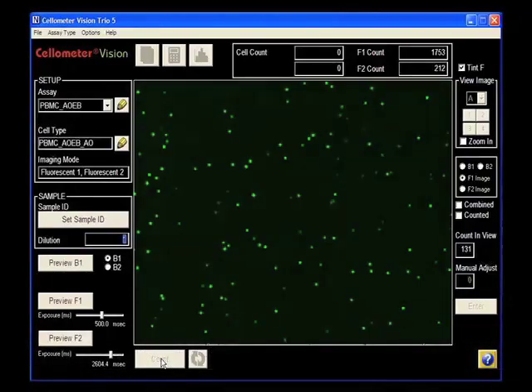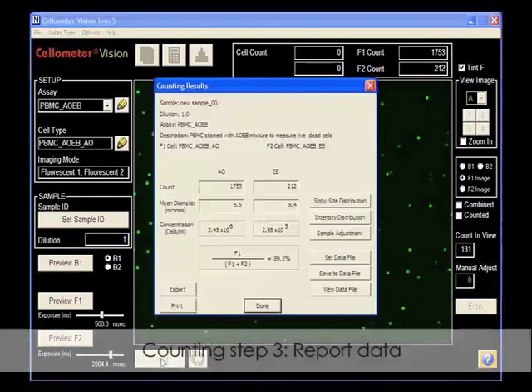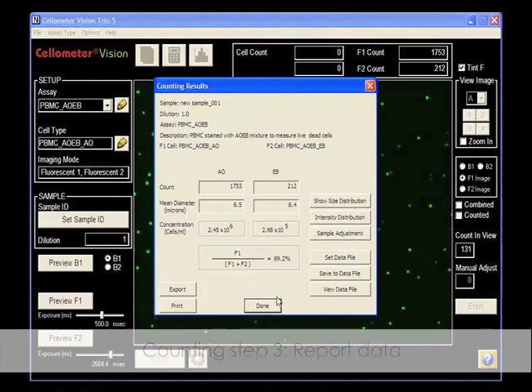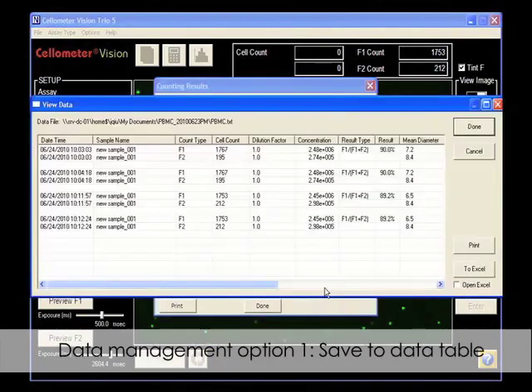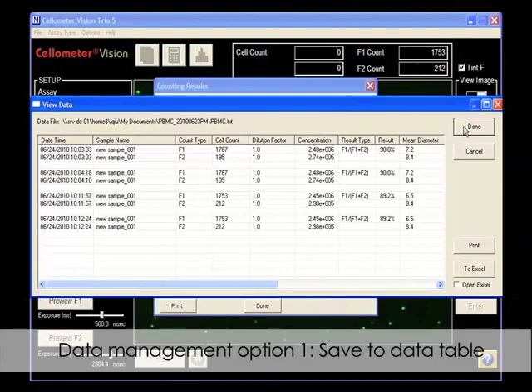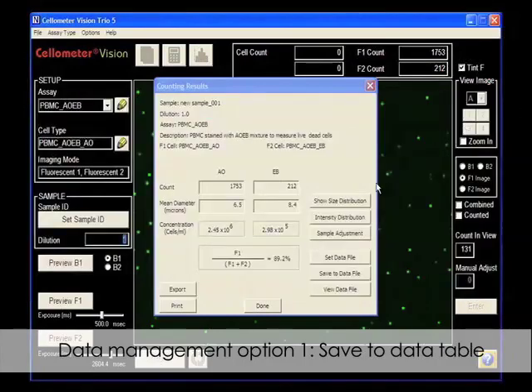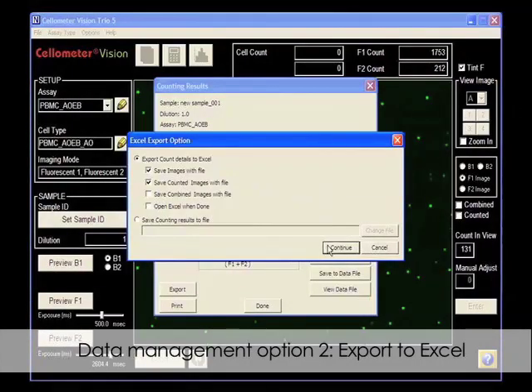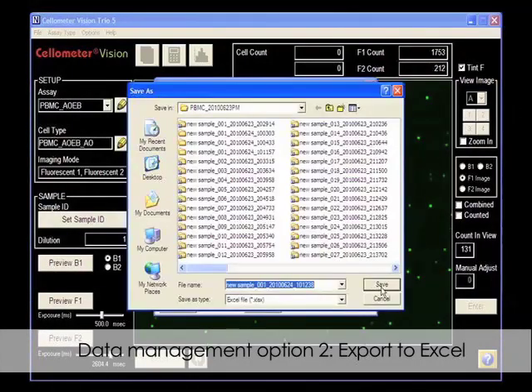Live and dead cell concentrations and viability are automatically reported. Counting data is saved in a table for multiple samples. Export to Excel saves the information of each cell counted.